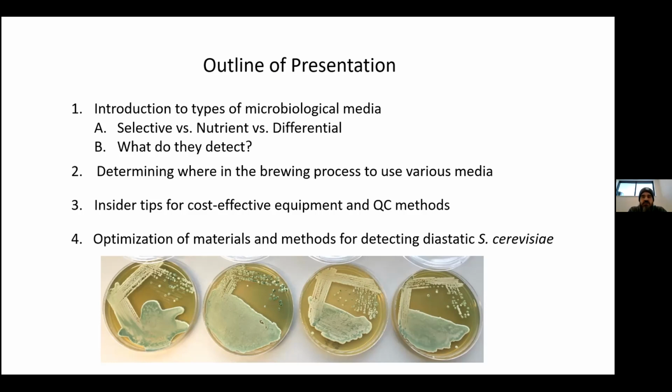One thing you may have noticed, if you're ever buying anything from a science supplier, is that it seems outlandishly expensive, and it is. So if you can find essentially the equivalent items that are being sold to people in a non-scientific context, you can find them much, much cheaper. I'll give you a handful of examples of that.